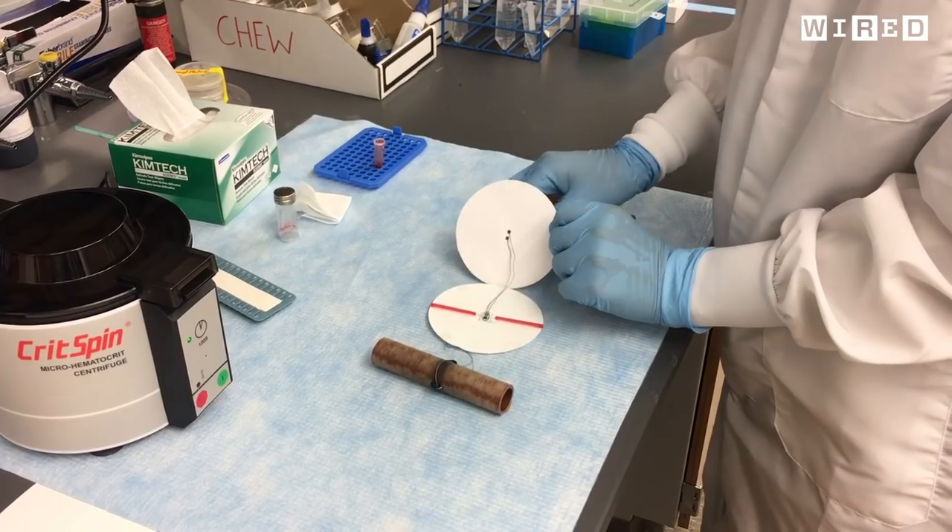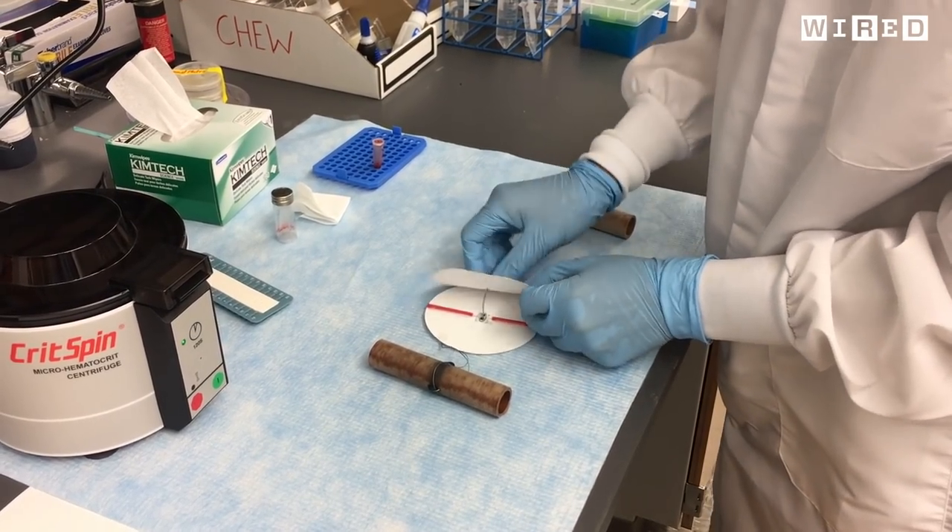They set out to design one that requires no electricity, is completely light and portable enough to carry in a pocket, and costs less than a dollar in parts so they could actually scale manufacturing. By boxing themselves in with constraints, they could think outside the box.